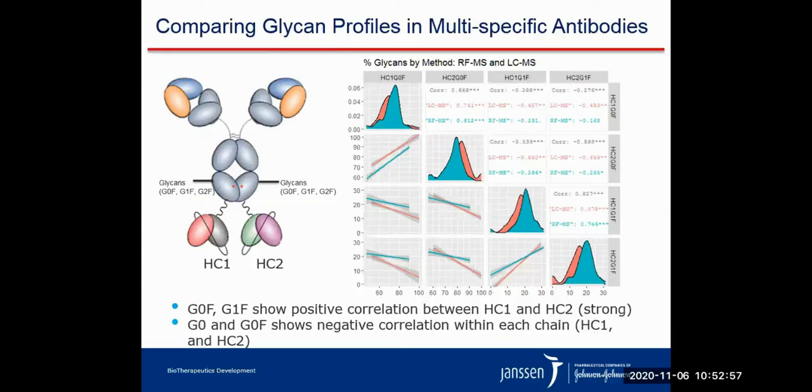In addition, glycosylation on multi-specifics can be compared by reduced mass analysis. The non-identical glycans on each heavy chain can be rapidly analyzed using RapidFire during product quality screening. We have compared glycans between LC-MS and RapidFire-MS approaches and find a good correlation between the major glycoforms.